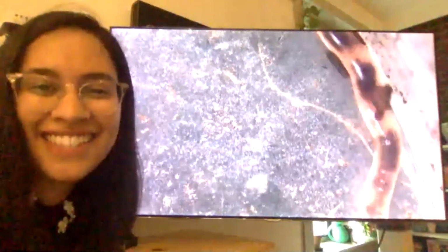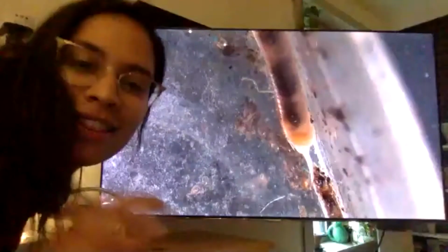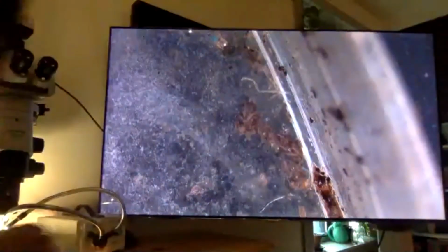I see. So the top half is the pre-digested stuff, and the bottom half is the poop. Possibly. What I was also noticing was that the yellow stuff looks like it's at the top and the bottom, which is interesting, right? Do you see it on the end here? Come here, little friend.